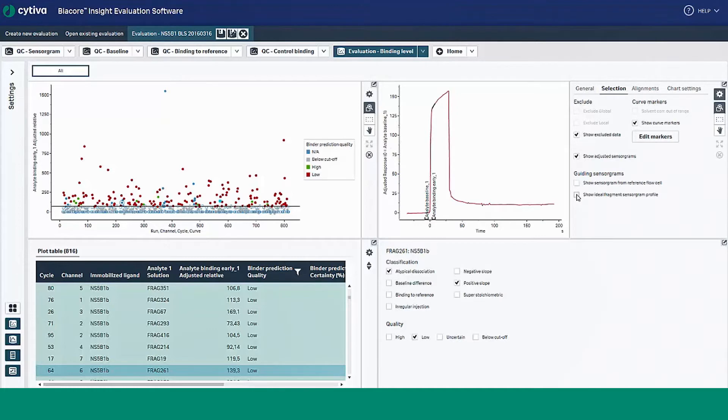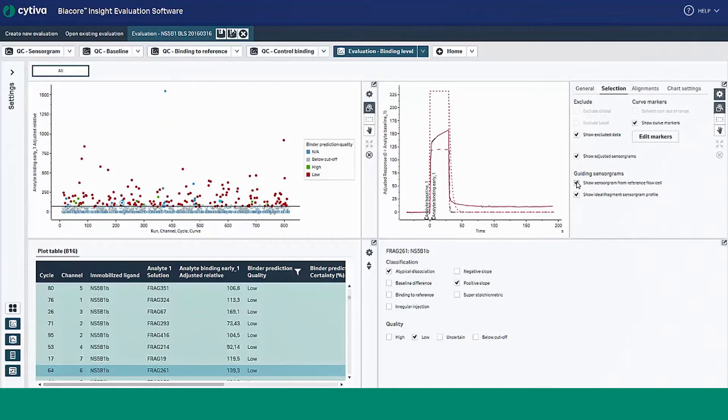You can easily toggle these on and off using the chart setting option shown. For more information on these features, refer to the Biocore Insight Evaluation Software Manual.